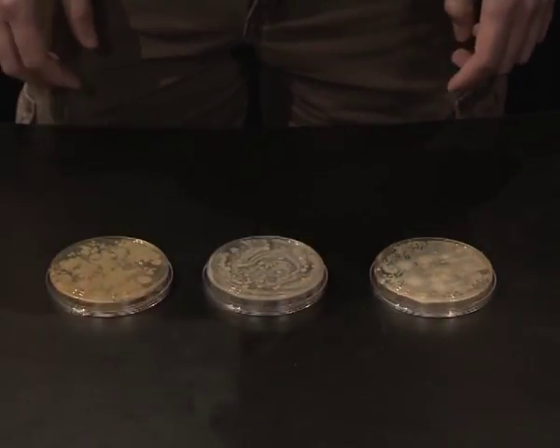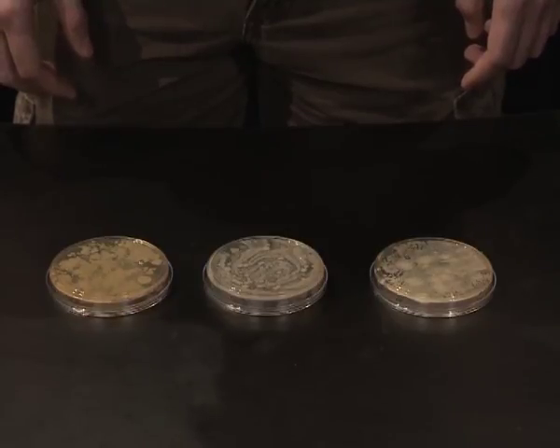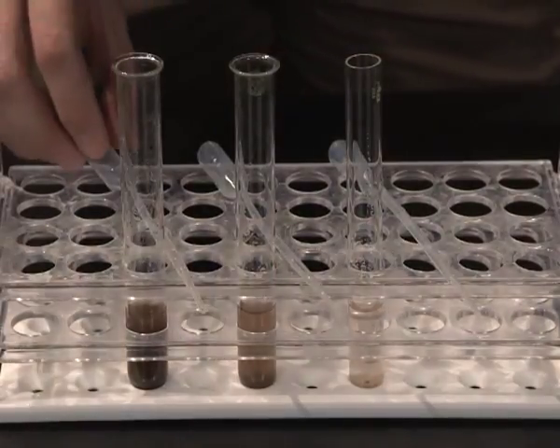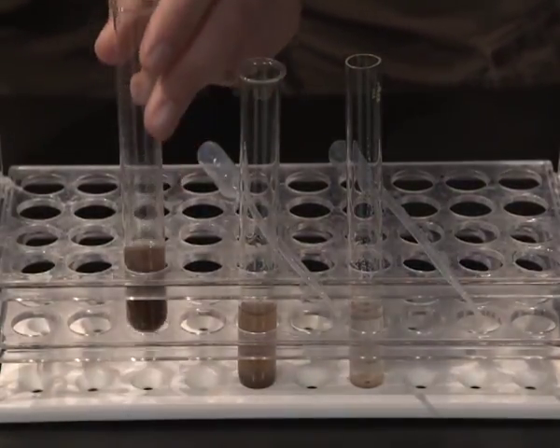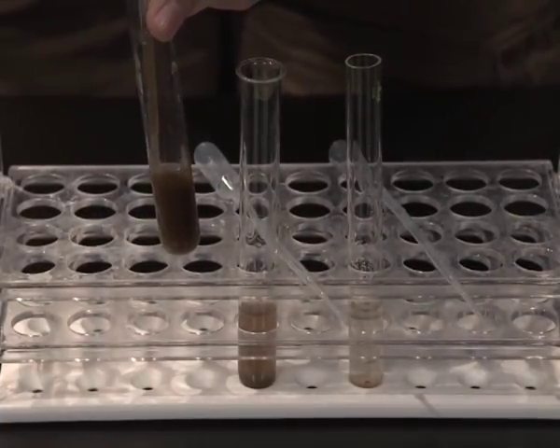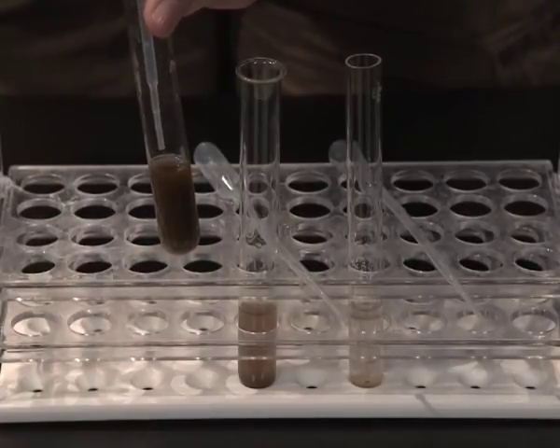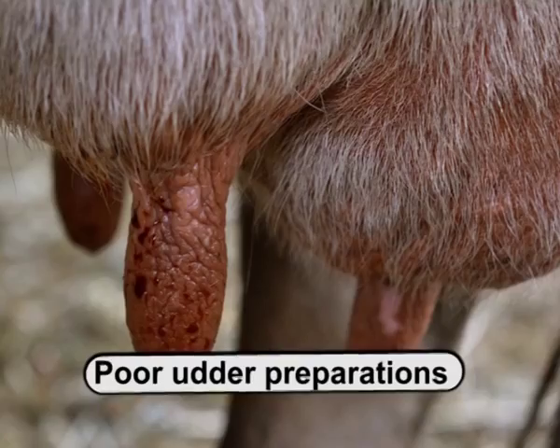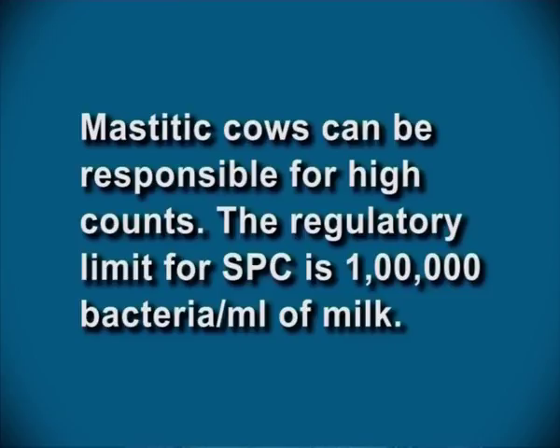Standard plate count or plate loop count, SPC or PLC, is the measure of the total number of aerobic bacteria in the milk. The most common causes of high SPC could be unhygienic milking equipment, poor cooling and poor udder preparations. Mastitic cows can also be responsible for high counts. The regulatory limit for SPC is 1 lakh bacteria per ml of milk.